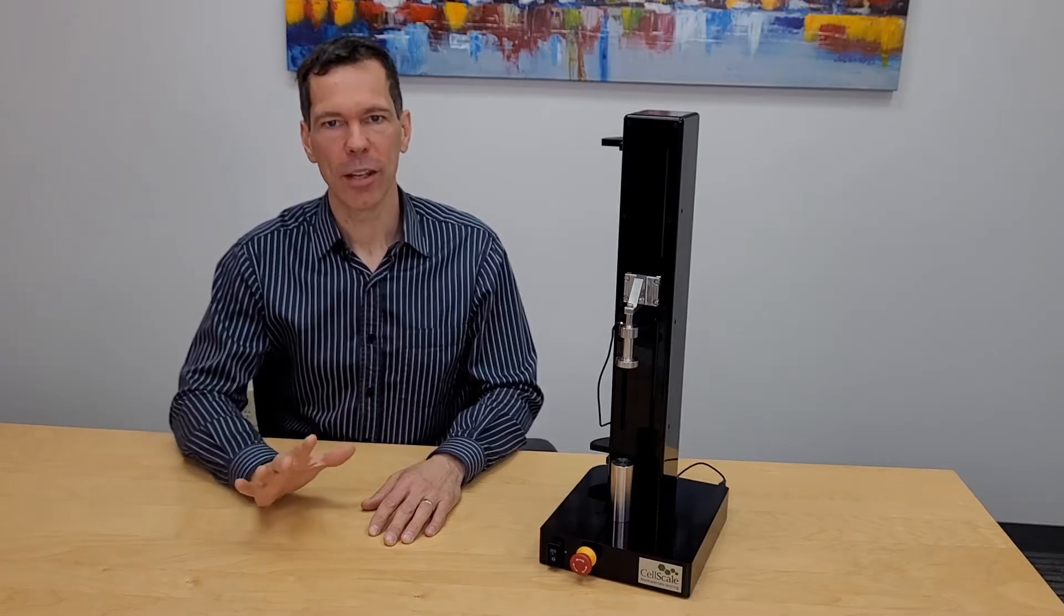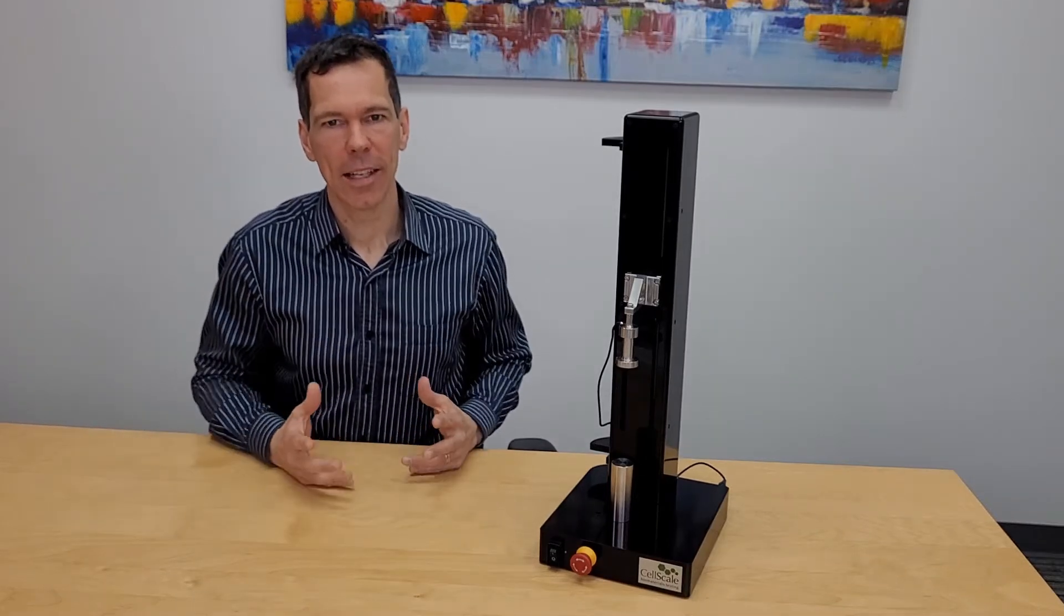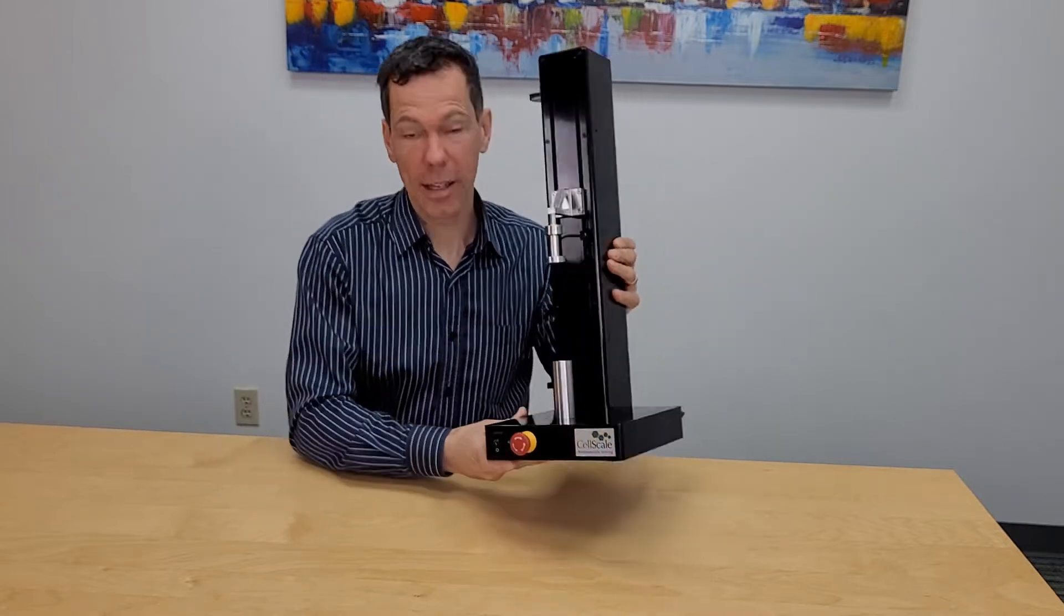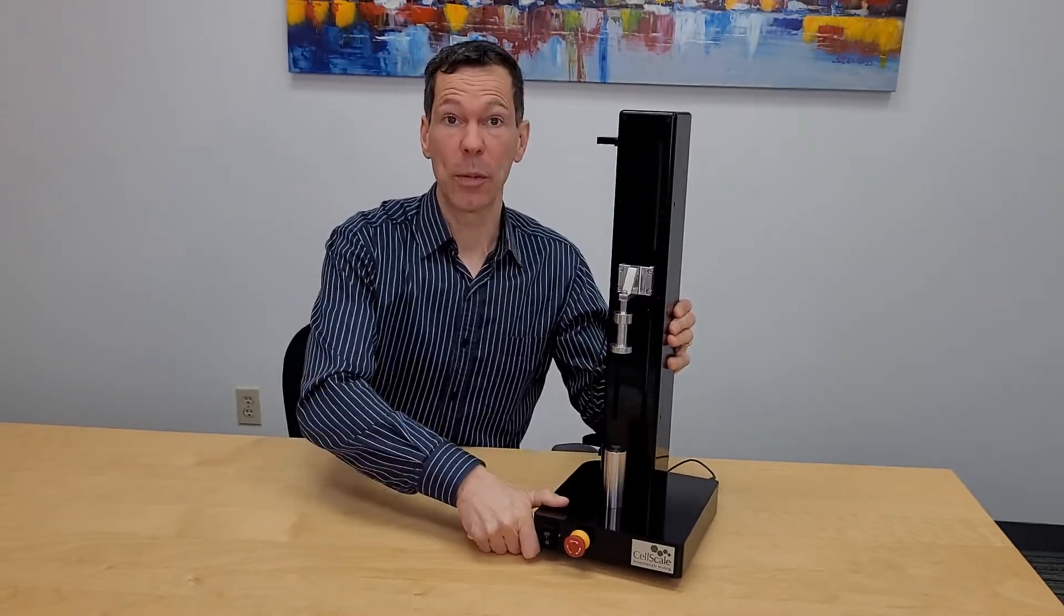This is a small form factor system that you can really have that test capability right where you need it. If it's not right where you need it, it's quite portable. You can take it with you.